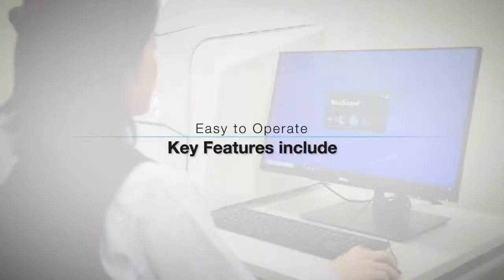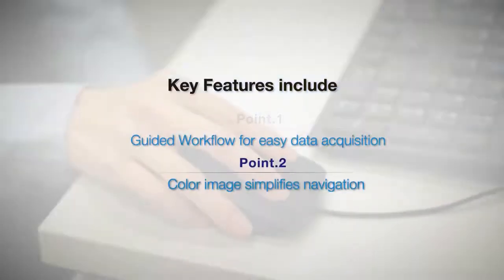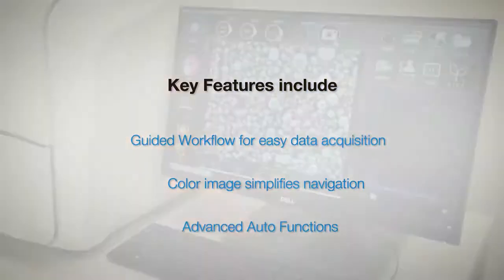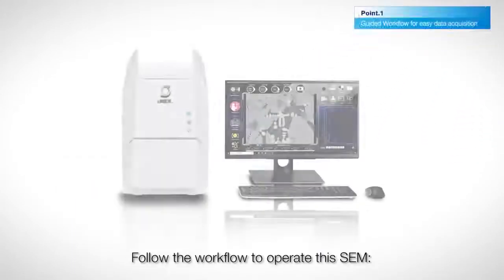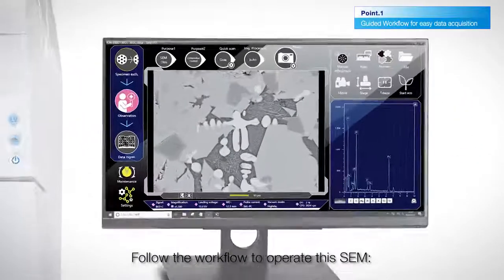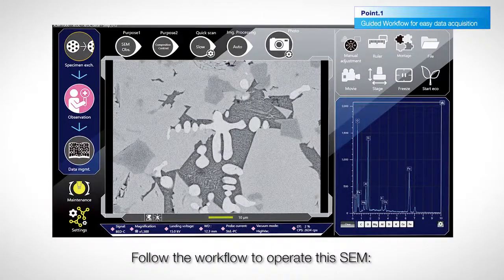The JCM-7000 is characterized by its ease of use. Here are three features that even beginners will love to operate this SEM. Follow the workflow shown on the left side of the screen.